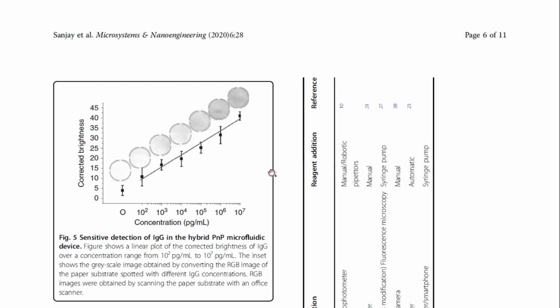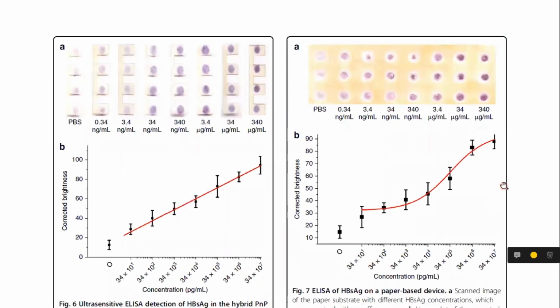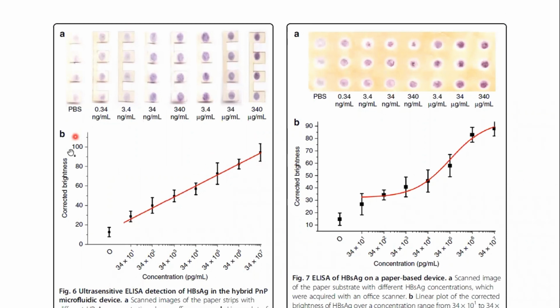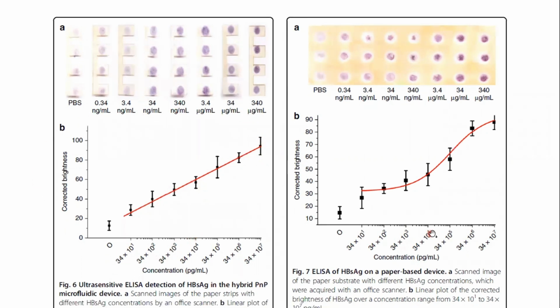so we can then make quantitative analysis of our samples. We can establish the quantity of antigen that is in a specific sample, or the quantity of antigens that a person has. Here is the same assay, but using hepatitis B surface antigens. Here is the assay performed using the hybrid plug-and-play microfluidic device, and here is the comparison with the paper device. Here we can see that in the hybrid plug-and-play microfluidic device, a linear correlation between the concentration of this antigen and the corrected brightness is observed.